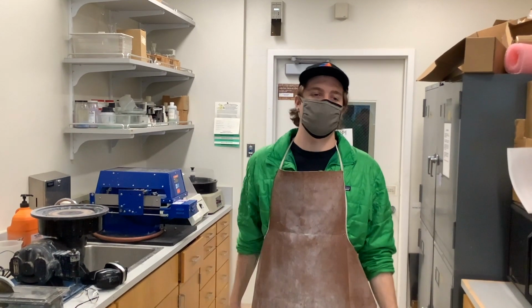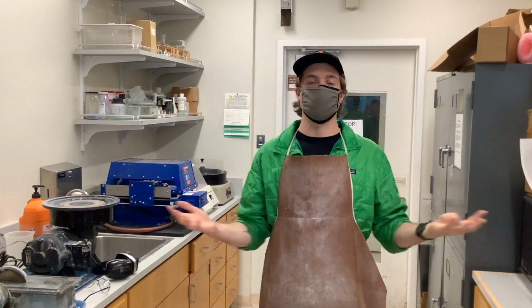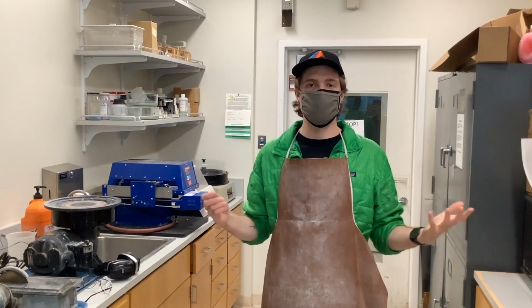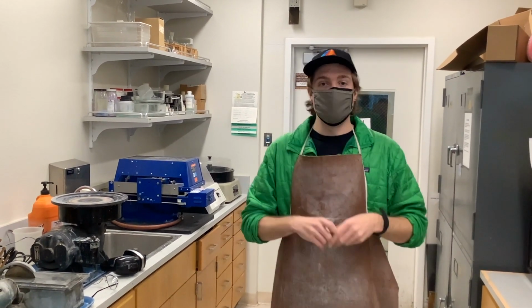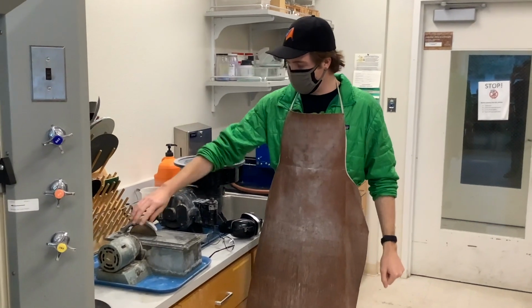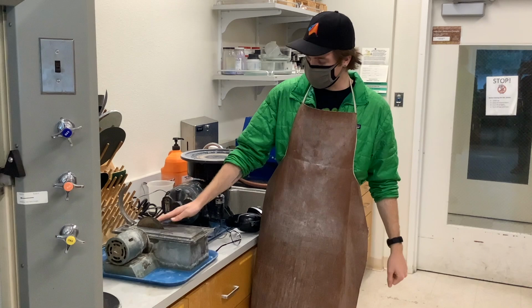Hey folks, TA Graham here. I'm going to show you how we slab rocks or cut rocks on the rock saw. We call it slabbing because we'll cut them into slabs that we'll work with. So this over here is a rock saw. There is a water bath sitting below here, and then there's a saw up here.